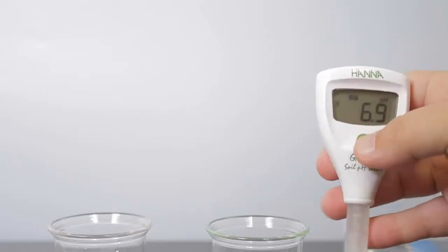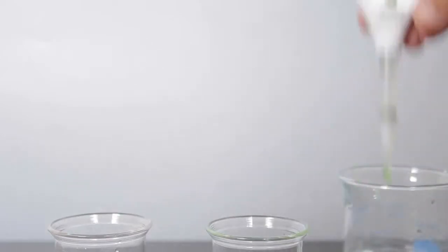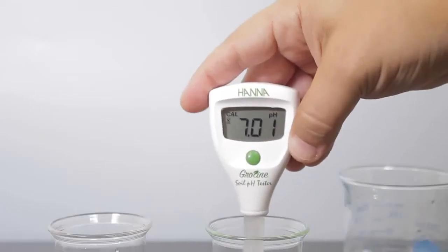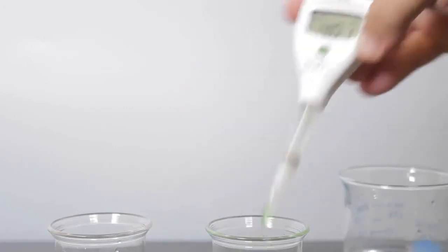To calibrate your tester, press and hold the button for 3 seconds until CAL appears on the screen. Rinse the electrode in deionized water and place the tester in your pH 7.01 buffer and wait for a stable reading. Once stable, the tester will automatically store the calibration and prompt you to use pH 4.01 buffer.